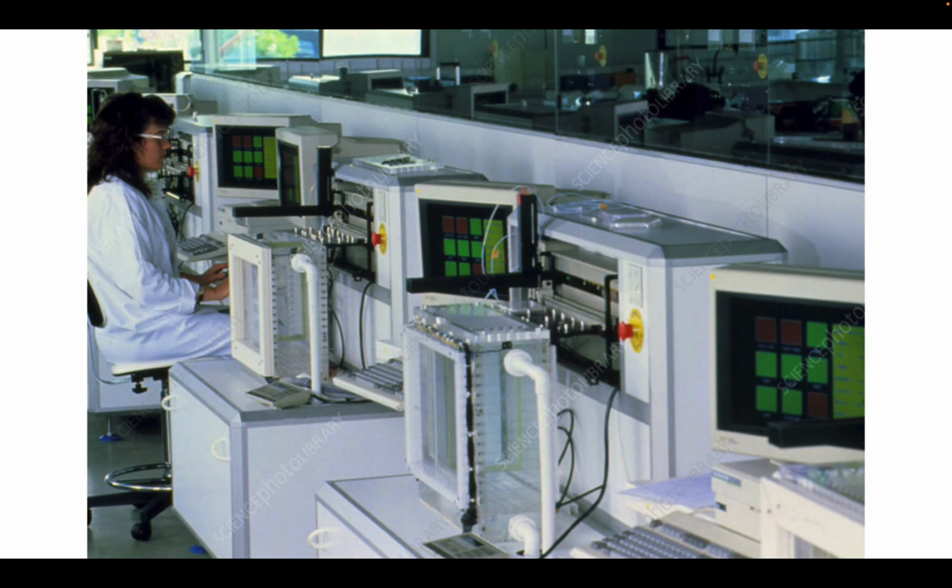Now, some of the challenge here is this isn't very high throughput. You can only sequence one fragment at a time, so it can be very, very slow. And we also didn't really have a lot of the computational power to assemble and put all of these sequences together. So to sequence, for example, the first bacterial genome took something like 3 months of these machines running 24/7.